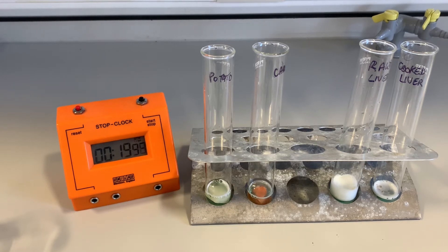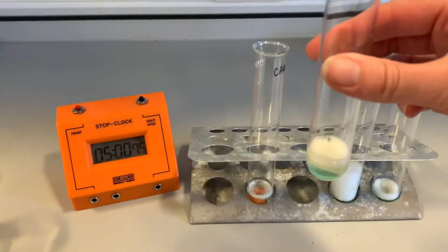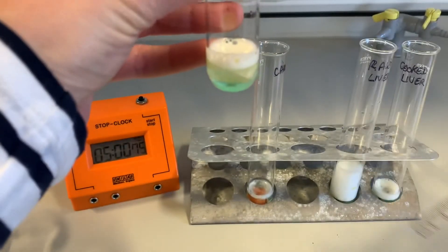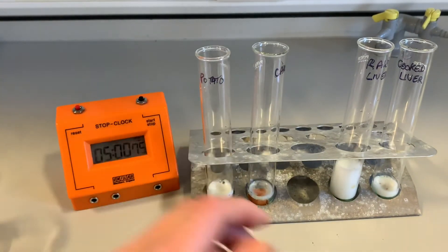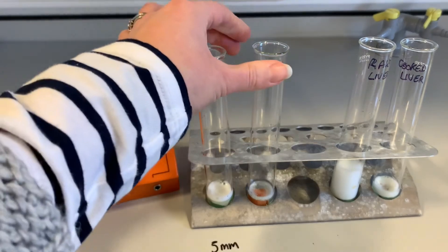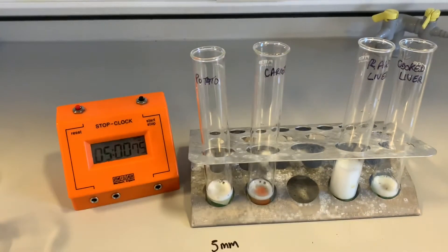As we come to the end of our five minutes, what we're going to do now is measure the height of the froth in each of the test tubes. We have a look at the one with the potato first. We are going to measure the height of froth in millimeters. For the potato we have got five millimeters, and we have got three millimeters for the carrot.